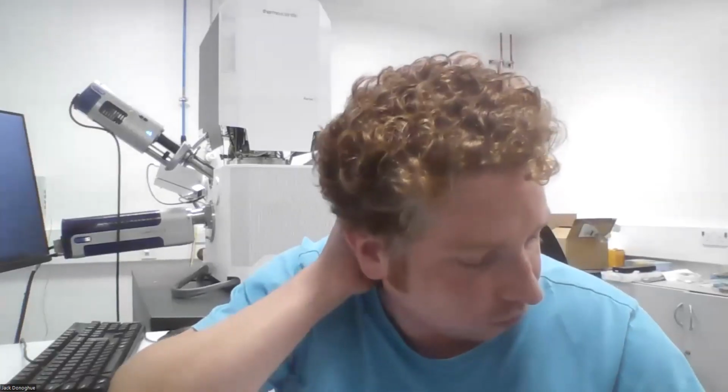It's one of those where we get down to how much data is too much data. We can only stitch a data set together if it has fewer than 64 million pixels. But if you think about 64 million pixels, that's an awful lot of data. You're going to struggle to analyze that. So sometimes bigger isn't better. And when you get onto these very large areas, what is limiting you isn't necessarily your detector speed, because so much of the mapping time is taken up by stage movements. And that becomes a big factor in any of these scans.